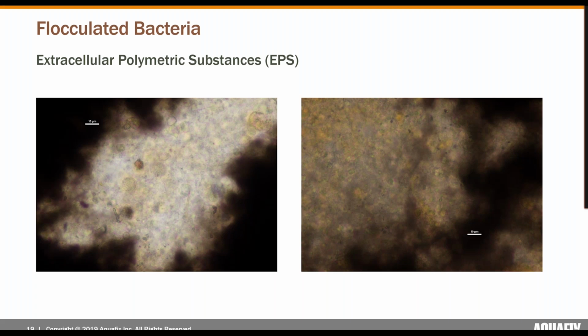So when analyzing floc characteristics under a microscope, our primary analysis of floc structure and strength is going to be analyzing the presence of extracellular polymeric substances, or EPS, as I stated earlier. This is one of those flocculating agents that help with floc formation, and the primary one in that. We use an India ink stain to actually analyze EPS levels, as higher levels of EPS within floc are going to repel more black India ink and thus produce a brighter floc field underneath the microscope.